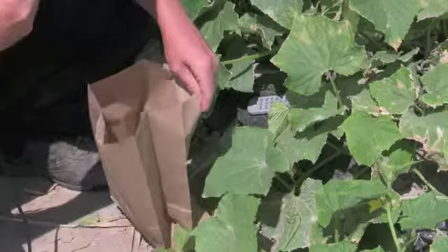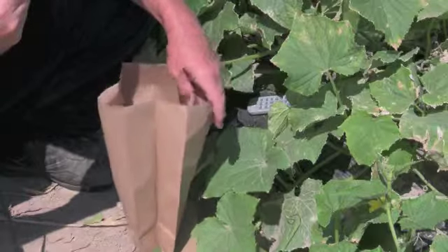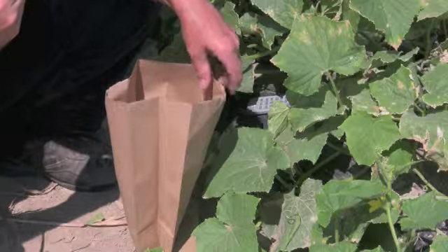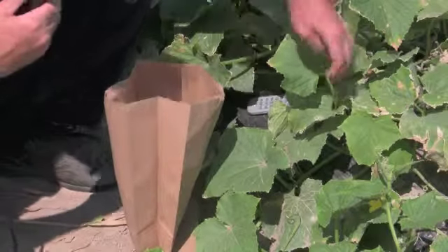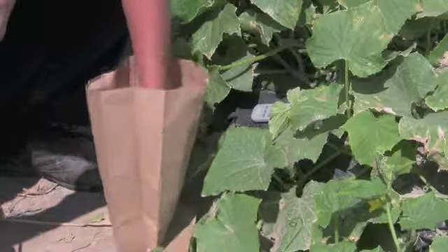Now, if it's going to be a while before you can get these to the clinic, I would hopefully have a cooler on hand. And if you're not going to be able to ship these out today, be sure to put these in the refrigerator overnight. And that should do it. I think I have enough samples here to get to the crux of this problem.